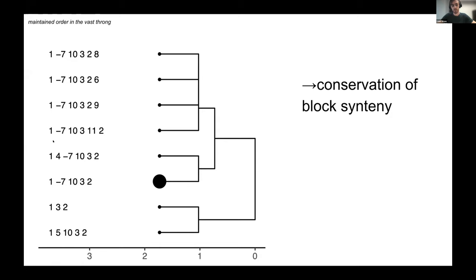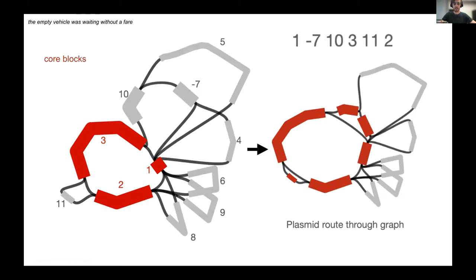You can see that here's the backbone plasmid sequence of blocks one, three, two. And then for example, this plasmid has one break point where five, ten has been inserted. And you can see that there's a lot of conservation of blocks internally. This backbone plasmid appears in the same order in all of those different plasmids. So this is quite interesting because we very quickly get a picture of how synteny is working in the plasmid, how the architecture might be going. We could think like, why is this region disrupted? Why between three and two, there's only one disruption compared to many other disruptions in the other regions of the graph. We can see there's lots of questions we can start to answer once we have this representation of the plasmids.